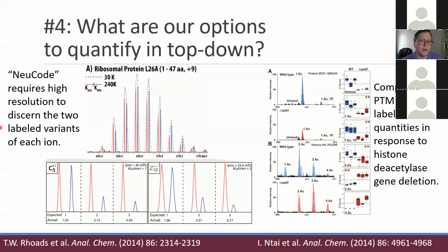I'm not sure I have enough experimental background to pin that one down, but I do know that the top-down community tend to be a lot more varied in their approaches to how ions get introduced to the mass spec in the first place.